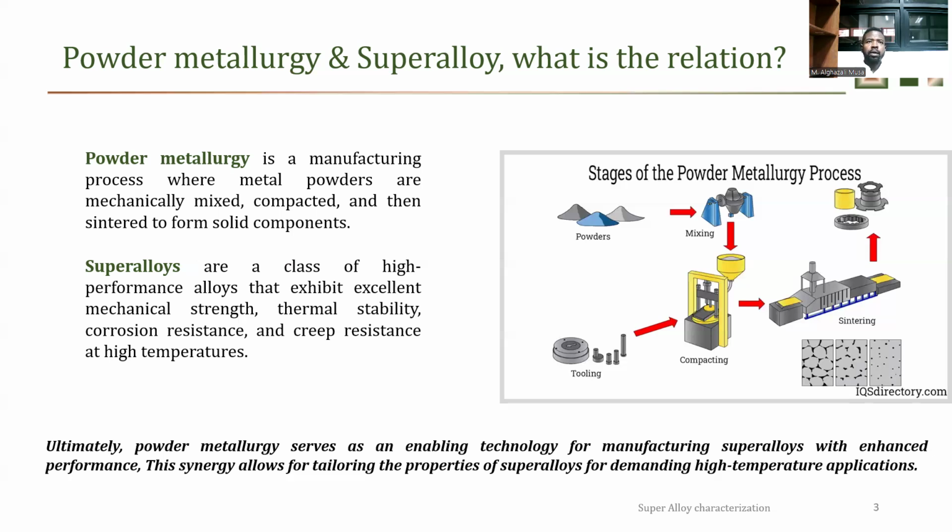In general, in this paper, we are trying to understand the distribution of copper within the mechanical mixing with the superalloy. So we have copper and we have superalloy. How about the mechanical mixing and the time for the grinding? How does it affect the homogeneity of the composite in general, and how could we detect or measure the performance through characterization? Of course, surface characterization could happen with different equipment. But how about the range of detection? How about the resolution of it? And also, how about the depth profiling? How could we do depth profiling using such equipment? So here is the main part of the topic.